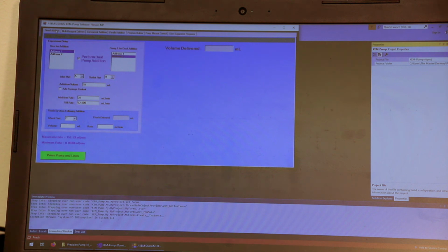Now what you can do with it is say, well, I'm running my reaction, but my reaction needs to be run at a very specific pH. You could enter, I want you to maintain that reaction, for example, at a pH of 5.2. So the reagent you would put on the pump at that point, for example, is acid. If your reaction produces base, then the reaction would run itself. The pump would continuously monitor the pH of the solution, and it would add small increments of acid to maintain the pH at exactly the pH that you requested.